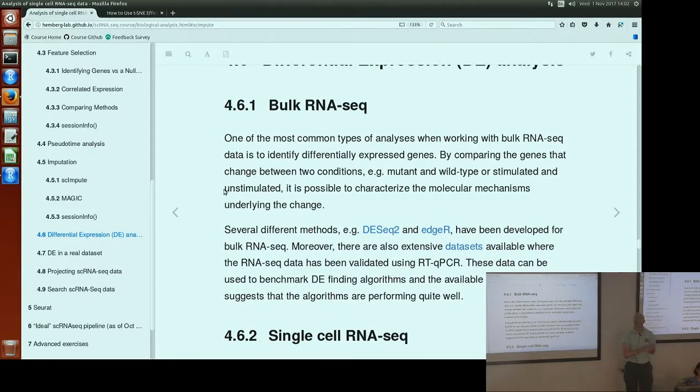No, I don't think so. I think these methods only look at the expression matrix. Essentially what they do is smoothing based on the other elements present in the row and column of where the 0 is found. But I do seem to recall that at least in the SC Impute paper, they point out that it would be a good idea to take these things into consideration, but I don't think the methods do that at this point.